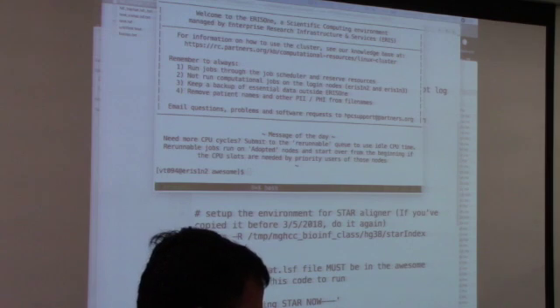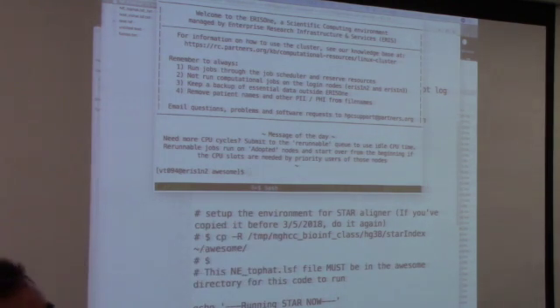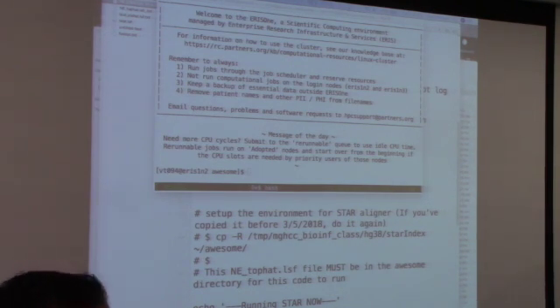So what's the advantage of then submitting it to the queue? The advantage is the queue will automatically still run. So on the queue it will still finish running. So it's not going to stop running if it's on the queue. Do you know what I mean? So once you submit the job on the queue, it'll continue to run. The only thing is if you close your session without screen, any error messages from the queue, if you don't have an error file or a log file, those will be lost. That's the only thing.